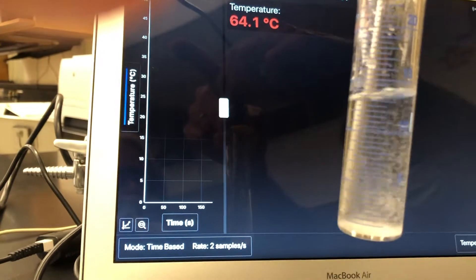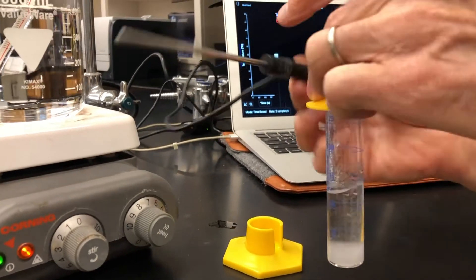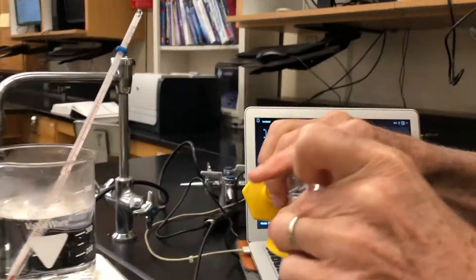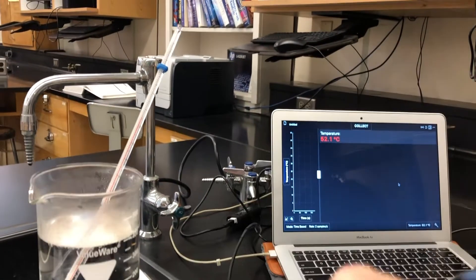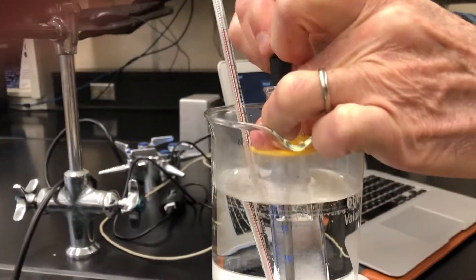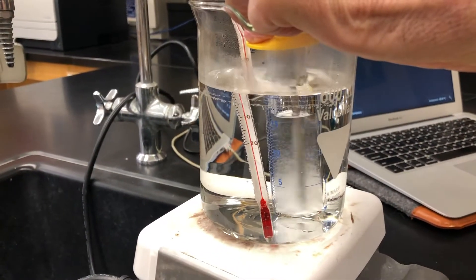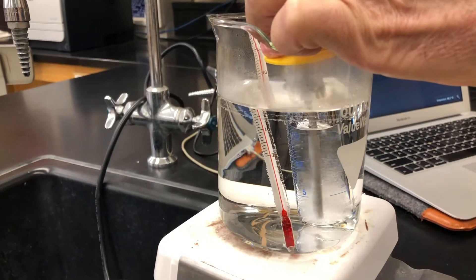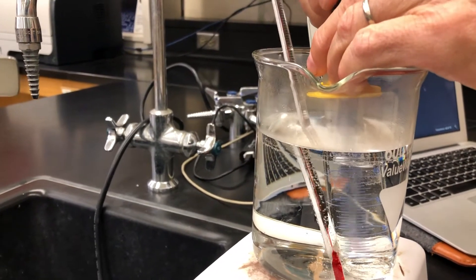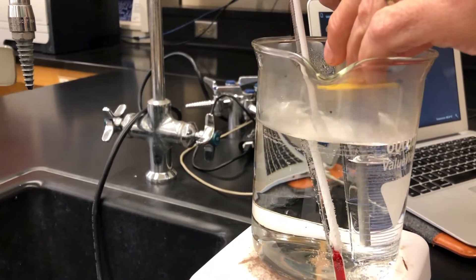Once we are very certain that crystallization has occurred, we'll remove the temperature probe and get ready for our second round. We're going to add about 3 milliliters of distilled water. The amount added isn't as critical as what the new solution volume is going to be. We'll heat this up to get all the potassium nitrate to fully dissolve. Since we have the same amount of potassium nitrate but added water, we've increased the solution volume and therefore decreased the concentration of KNO₃. We would expect it to take a lower temperature to get everything to dissolve.